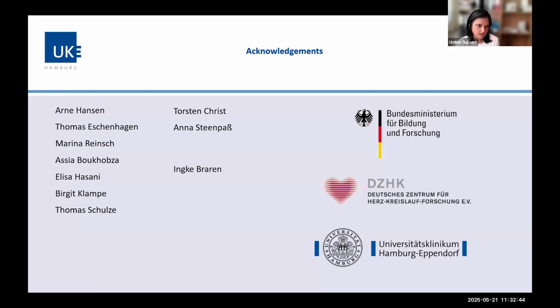And also these tissues do not survive for long, like for months, as I have seen with the calcium sensor. The calcium sensor had really no effect on EHTs, but this sensor had some effect. So we have a window of probably 2 to 3 weeks to do the experiments, and then EHTs start to decline in force.